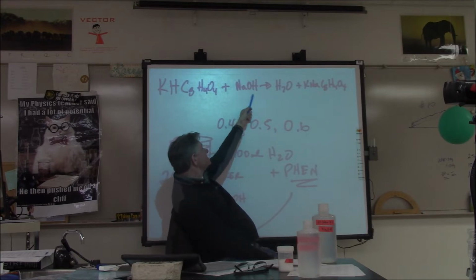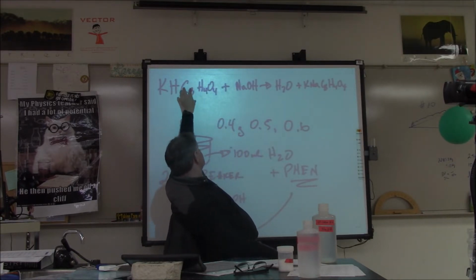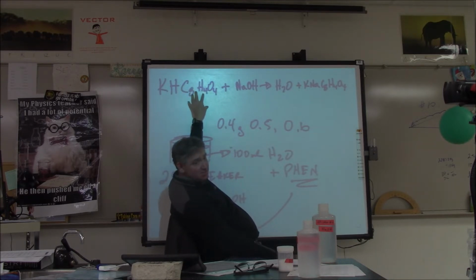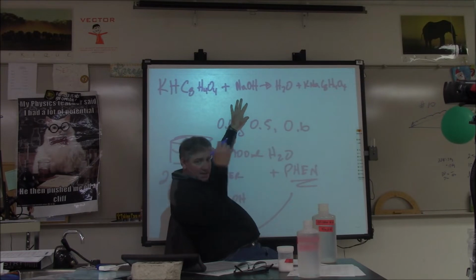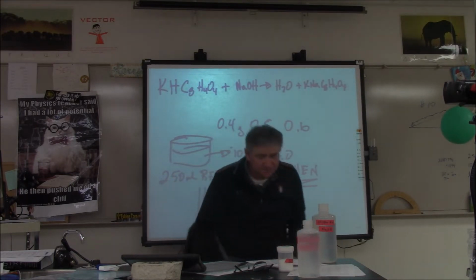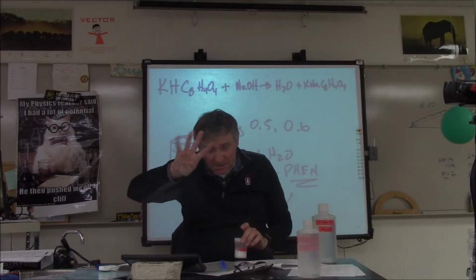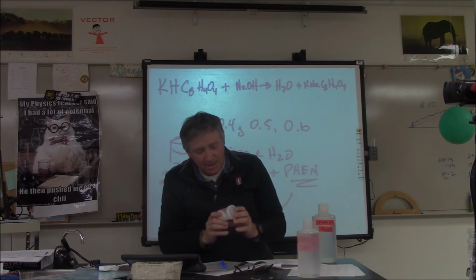The reaction is going to go until this KHP is used up. Once the KHP is used up, if you add any more sodium hydroxide, the solution is going to be basic. So I've got the 4-digit electronic balances over there, and you're going to measure out KHP.